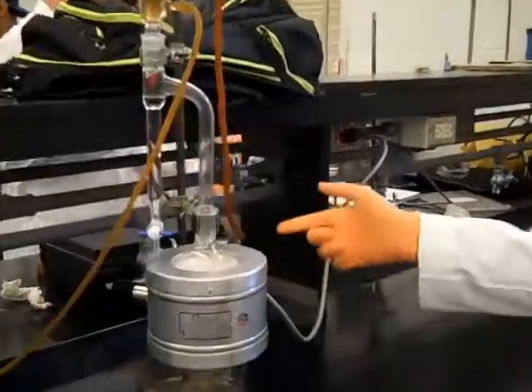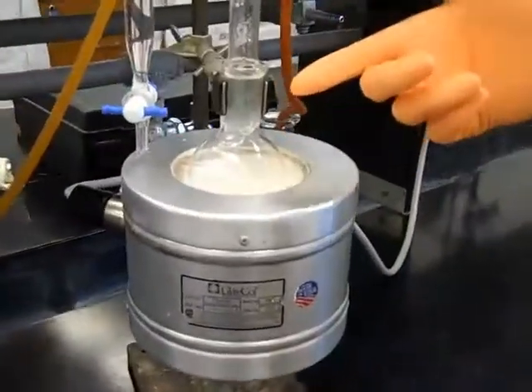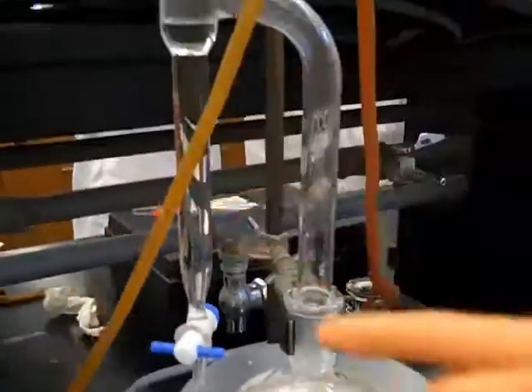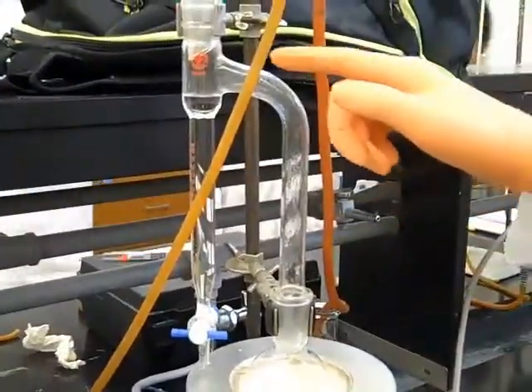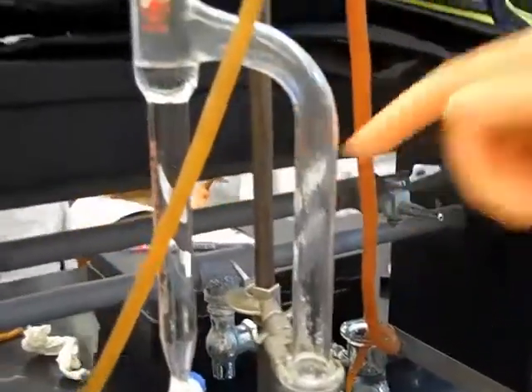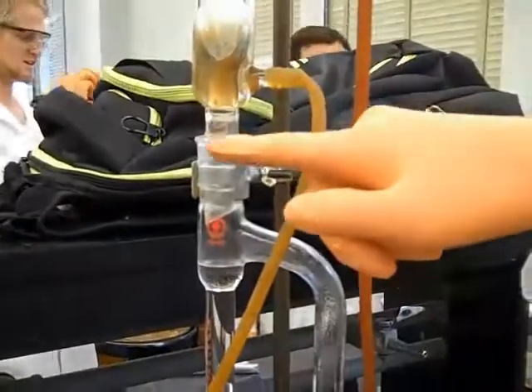Starting off, this is our heating well. This is our pot. This right here, starting right here and ending about right here, is our holdup. As you can see, there's already stuff collecting right there. Then coming up, this is where our distillate will come out right here.